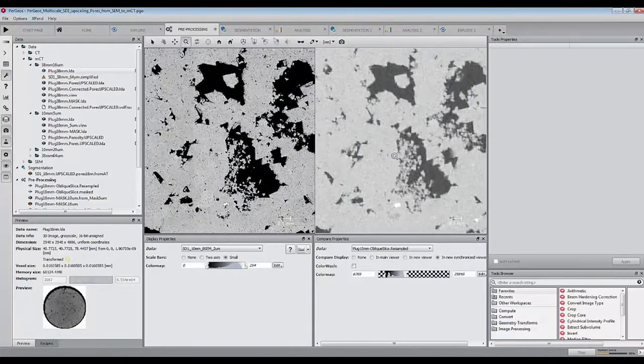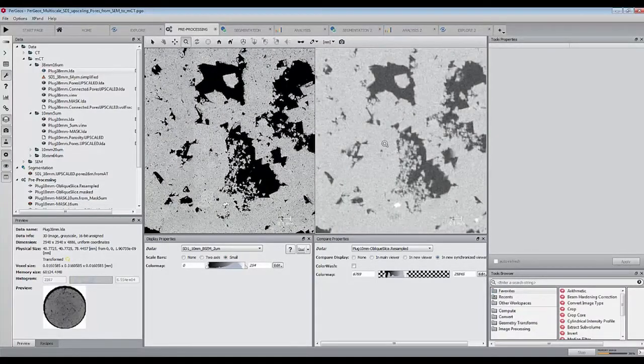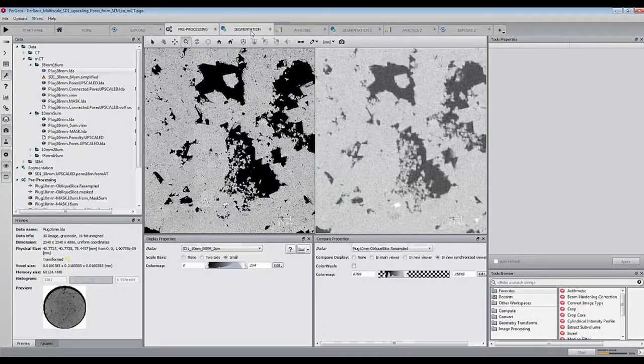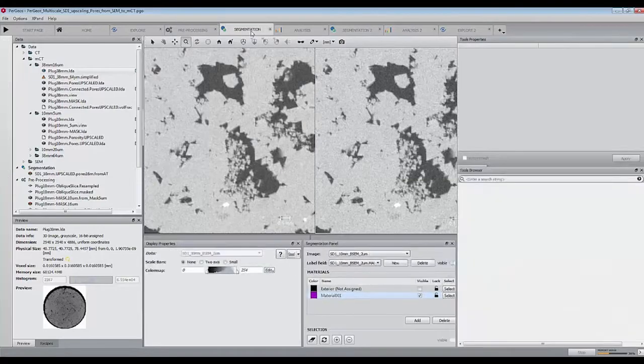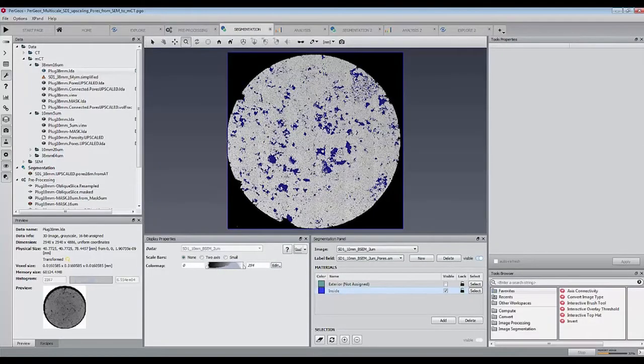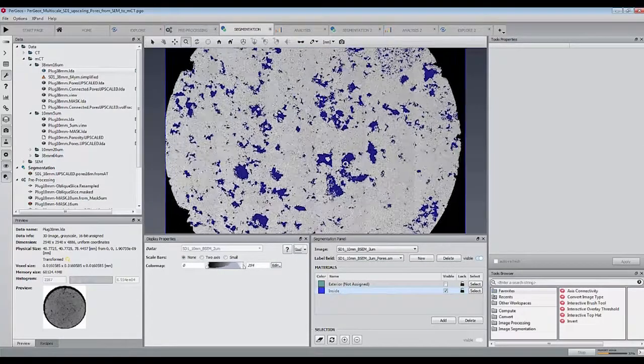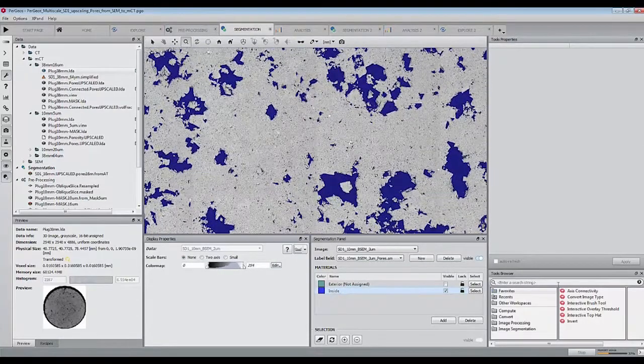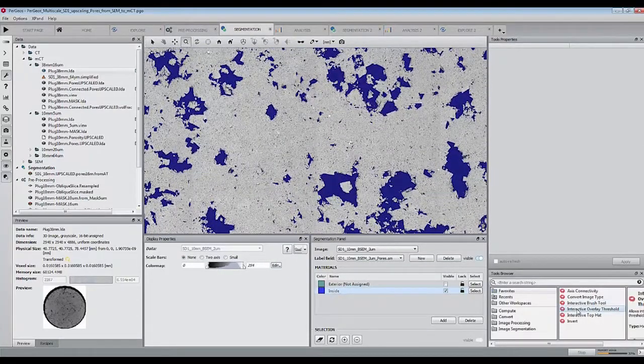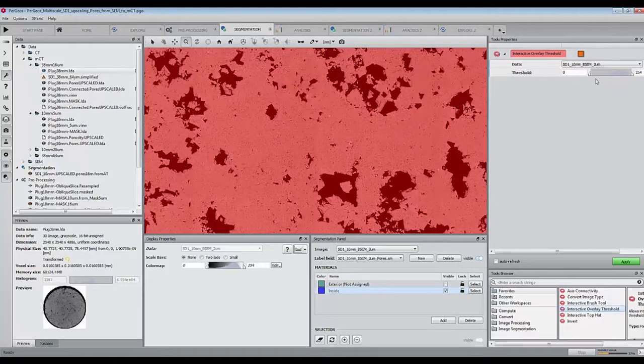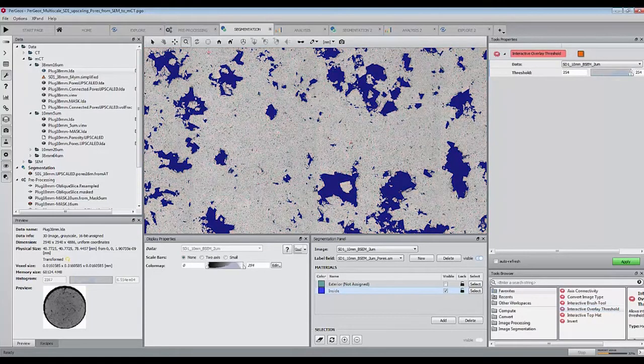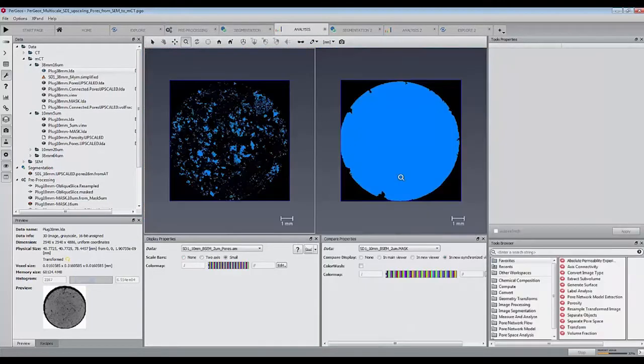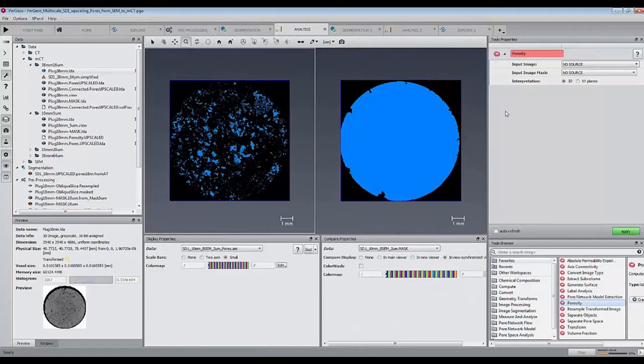That will let us segment the pore space at the high resolution and apply some strategy to validate the pore space segmentation in the 5 micron plug. The segmentation of the pore space at 2 microns is straightforward and we can achieve it with high fidelity with a simple thresholding.